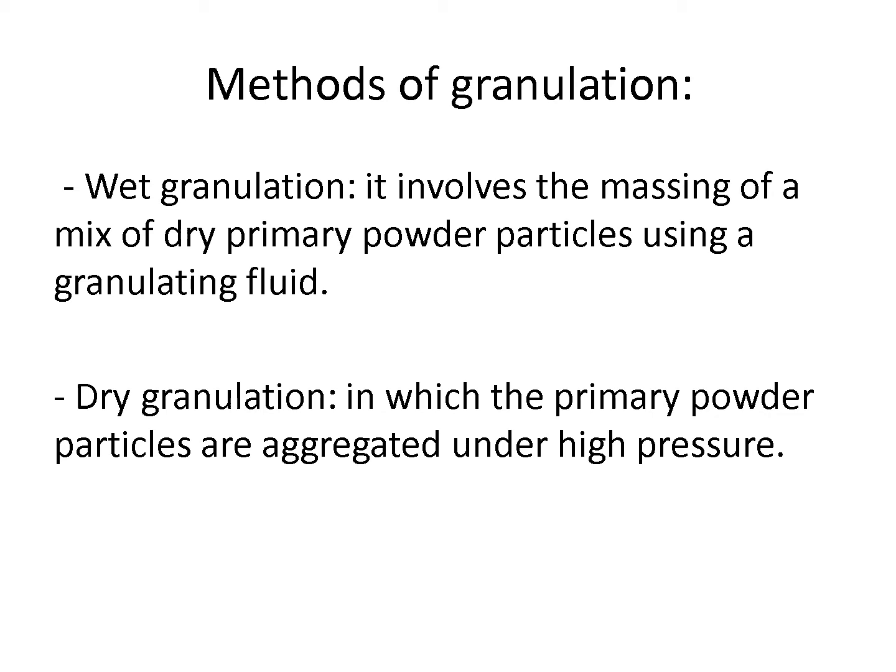While in dry granulation, as I said before, we don't use water or liquid. We add the ingredients in dry powder form. Even if I use a binder, it is in powder form. We mix it, then use slugging, where we compress into a sheet, or a roller compactor, forming a ribbon that will be fragmented into granules.